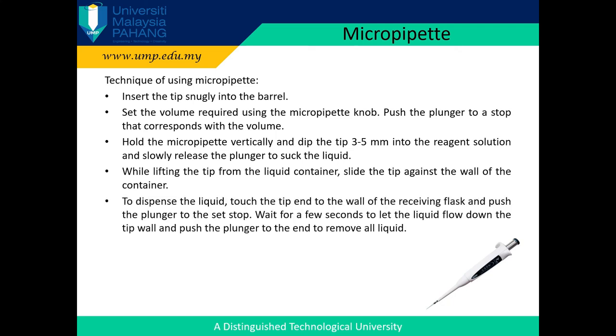To dispense the liquid, touch the tip end to the wall of the receiving flask and push the plunger to the set stop. Wait for a few seconds to let the liquid flow down the tip wall and push the plunger to the end to remove all liquid. Used tips can be discarded or washed properly for reuse.